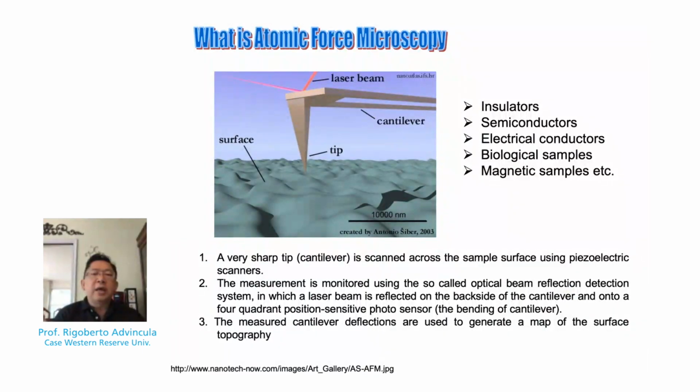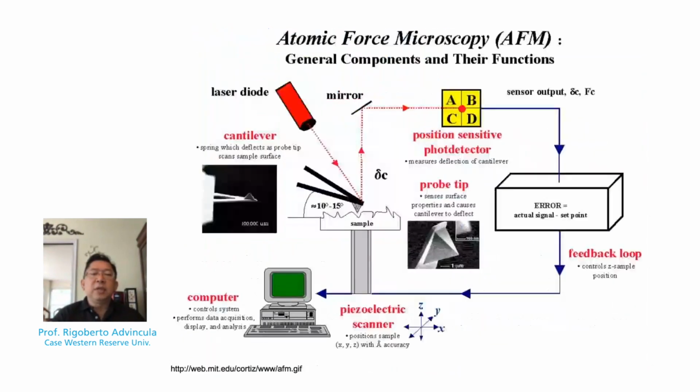In other words, other than its interesting probe for surface properties, surface forces, viscoelastic forces, conductance, electromagnetic behavior, etc. Overall, atomic force microscopy is still a microscopy or indirect microscopy technique that you can visualize the topology or morphology.